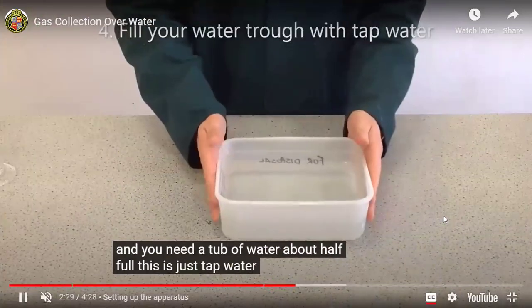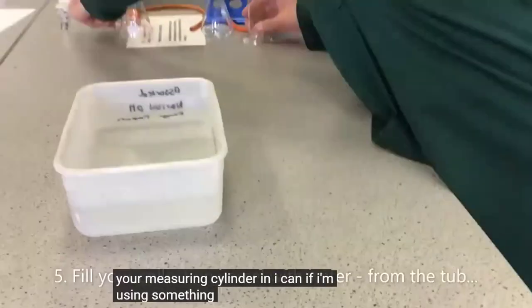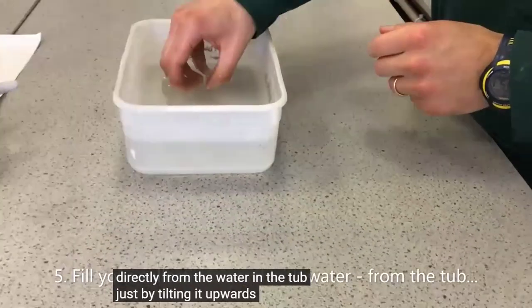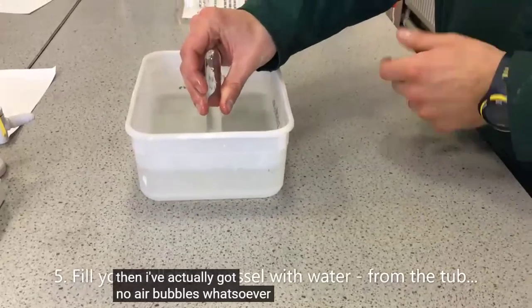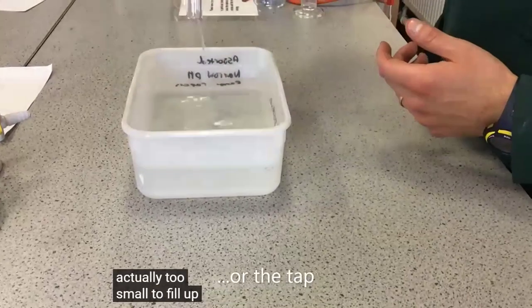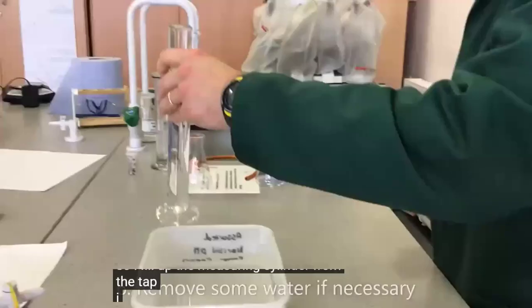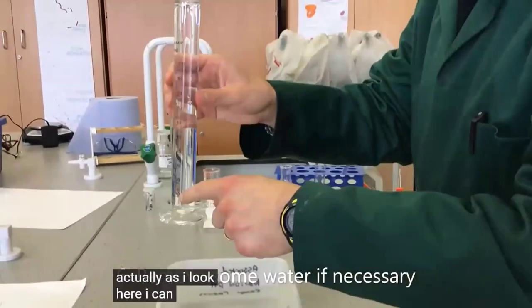We need a container in which we can keep water. That person is just telling you how to fill the test tube with water and then how you can keep it over there. But we are going to use a measuring cylinder. So you will fill that measuring cylinder with water, completely filled with water.